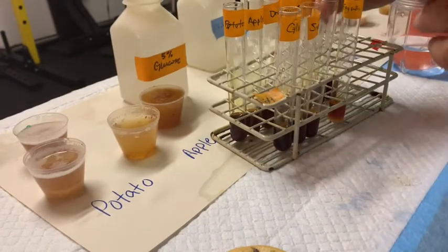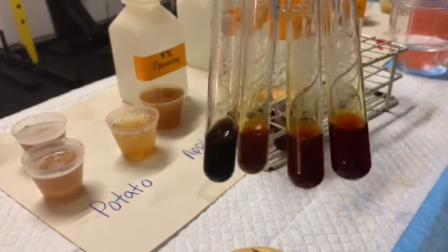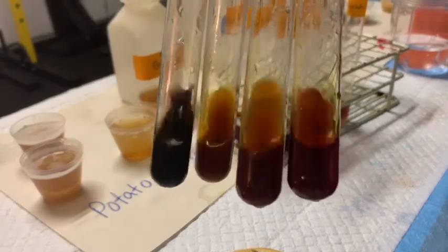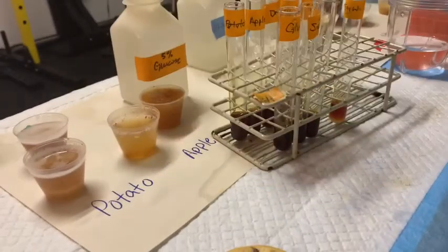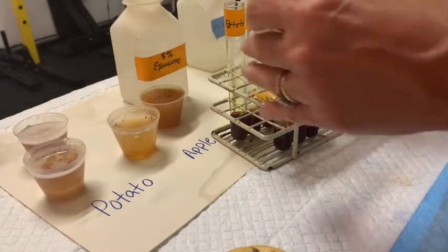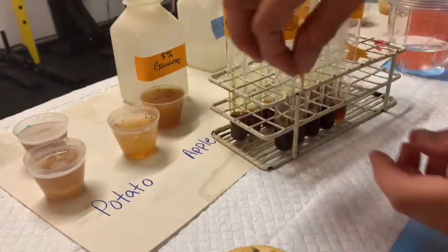Let's compare these to the three unknowns — again, not much happening here. There's our starch positive, and there are the unknowns: unknown one, two, and three. When you look at that color, the starch is nice and brown black, and our unknowns are not. So I would say basically the only thing that is positive in this reaction is going to be our starch — though all my labels fell off here.